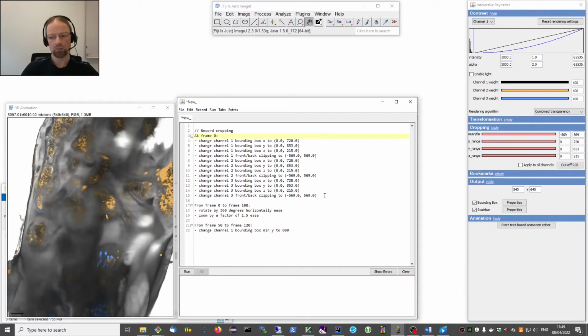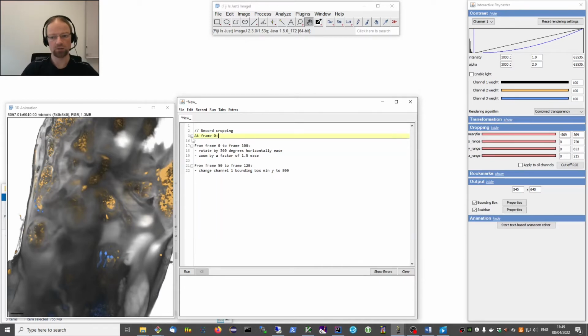Now something that's not so nice is that we have quite some text which might confuse, and so there are also folding capabilities of the editor which allow us to hide this in case we just want to blend it out and not get confused by it.